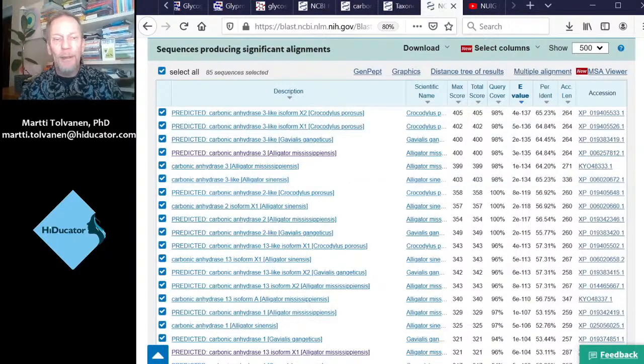And we are lucky enough that these were properly annotated, so that the names can help us in seeing if these jumps in e-values have any relationship with real biological relationships, like transitioning from orthologs to paralogs.